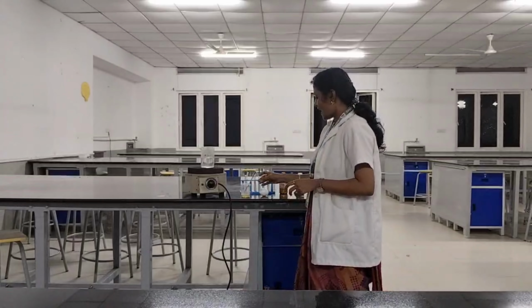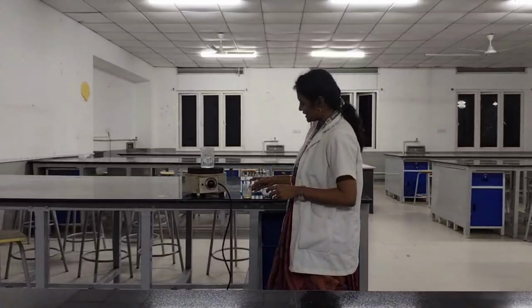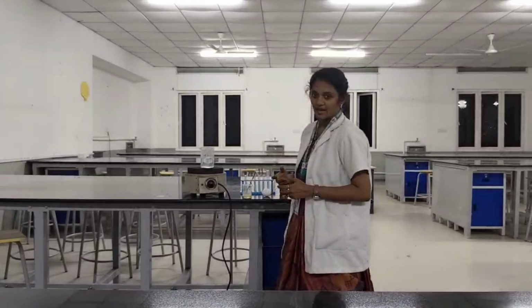There are a lot of qualitative analyses for proteins. Here, we are going to discuss the main, common tests like the Biuret test and Ninhydrin test. First, let's use an example. Actually, it is an unknown sample, but we are using a protein sample from the egg. We know that for proteins, first we have to test the solubility.